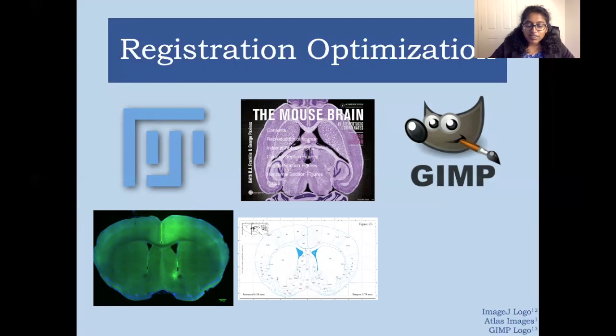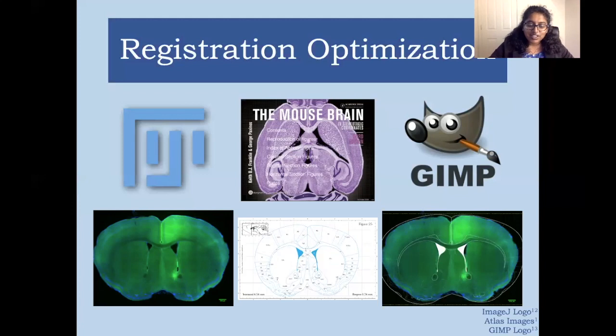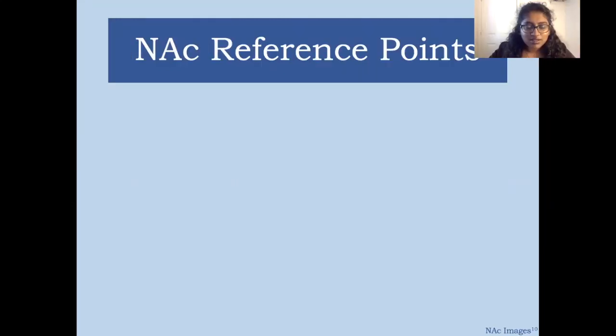We want to then manipulate the size, shape, and overall orientation of the map to best fit the reference points of the map over those of the brain slice. So once the reference map is overlaid like this, you can then begin analyses on the experimental tissue slices.